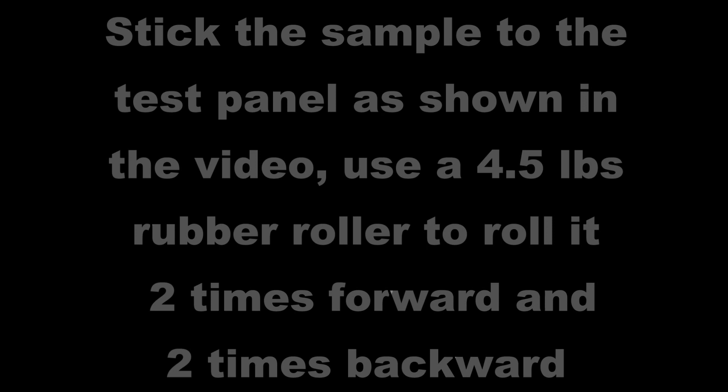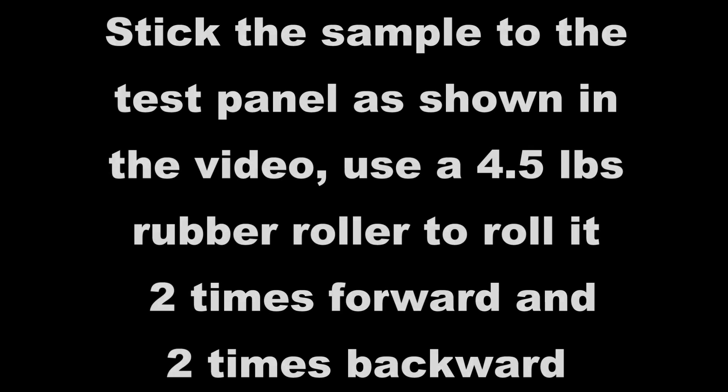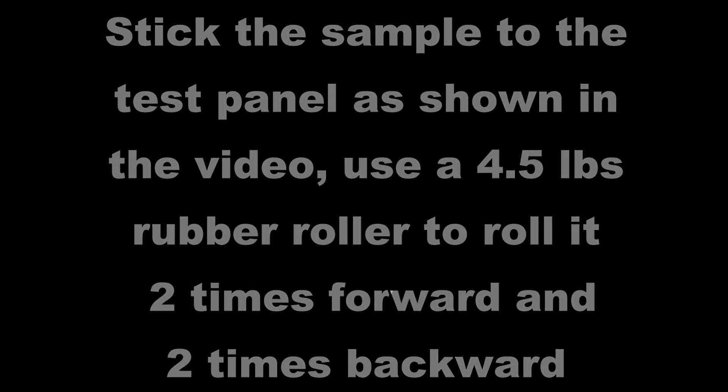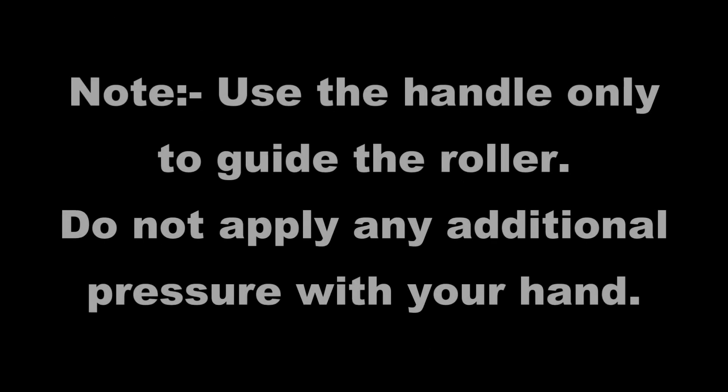Stick the sample to the test panel as shown in the video. Use a 4.5 pounds rubber roller to roll it 2 times forward and 2 times backward. Use the handle only to guide the roller. Do not apply any additional pressure with your hand.